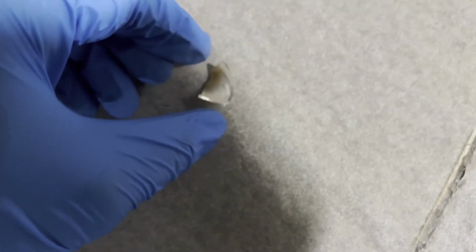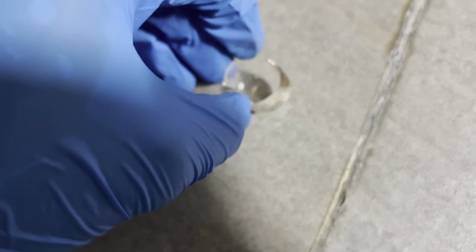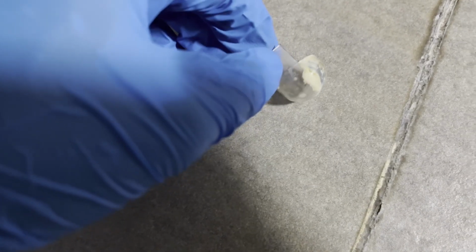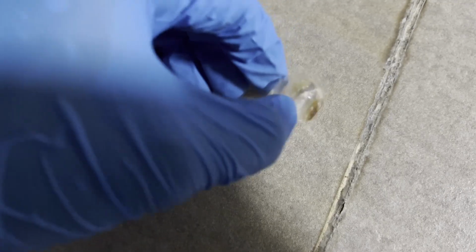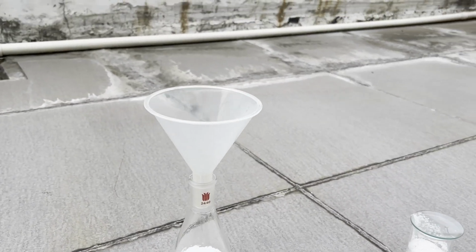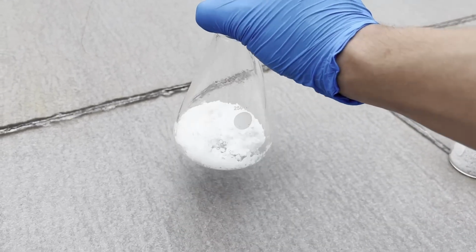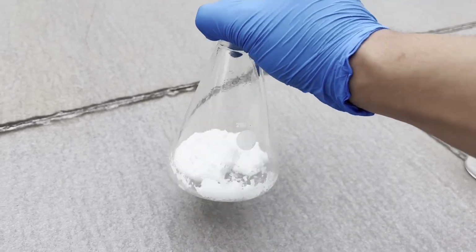But today, this first video is going to be a massive success as I prepare potassium azide and potassium metal from domestically available chemicals like hydrazine sulfate, nitrite, and N-butanol. Although the diazotization reaction of hydrazine has been done by many people before on the internet, the reaction is known to be dangerous due to the toxicity of hydrazine and azide.